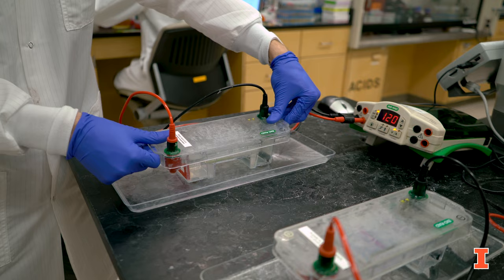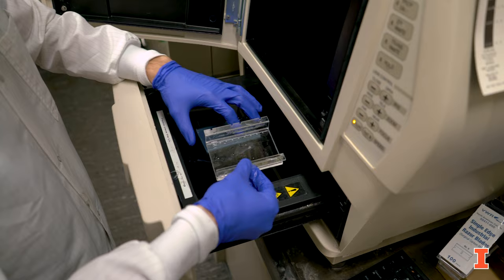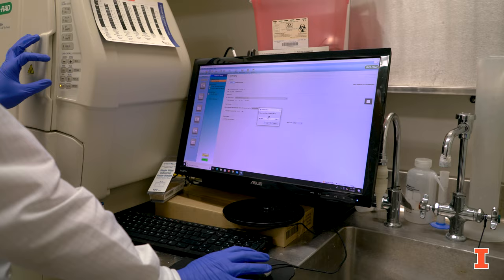Over here we have our gel station where we run gel electrophoresis. I've just loaded a gel and I'm currently running it. Basically what we're doing is separating out DNA of different sizes. This will help us verify whether or not we've constructed one of our vectors correctly. In 17 minutes we'll be able to take that gel and view it on the gel dock in the room next door.